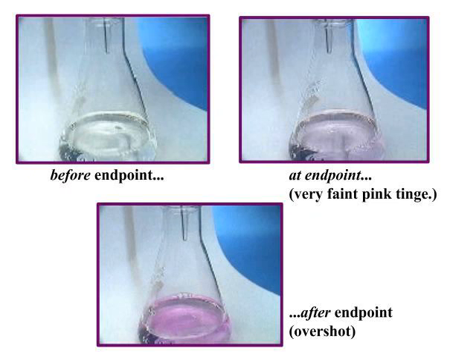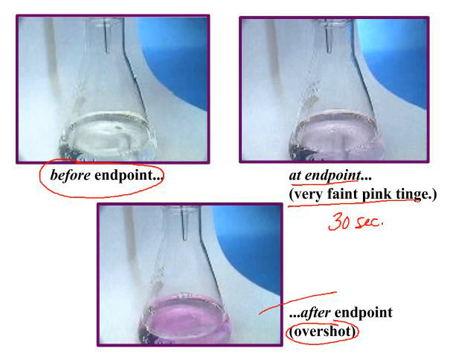When you're titrating, remember, before the end point, your solution will look like this. At the end point will be a very faint pink that lasts for 30 seconds. If you overshoot the end point, it's going to be this deeper pink, and you may have to repeat more trials than you would like to. So go slow and get a good result.